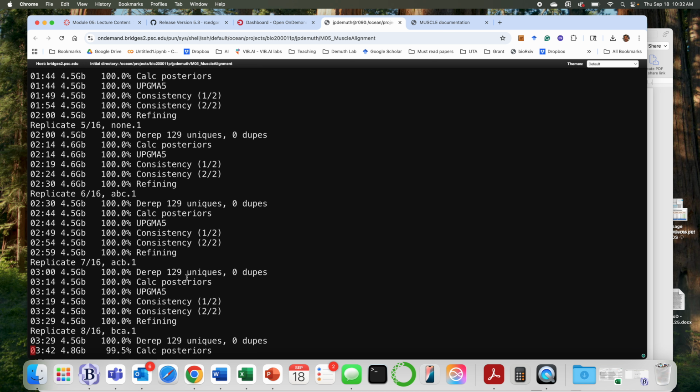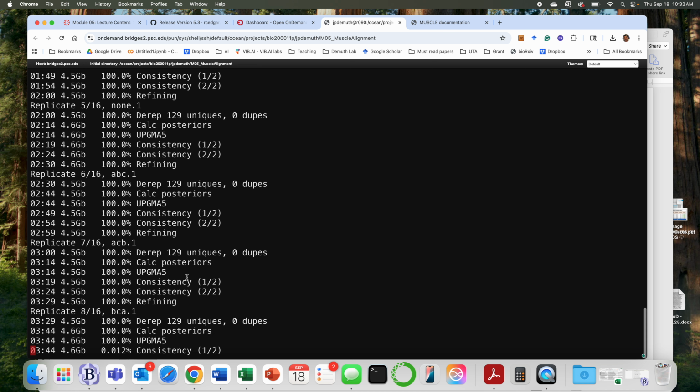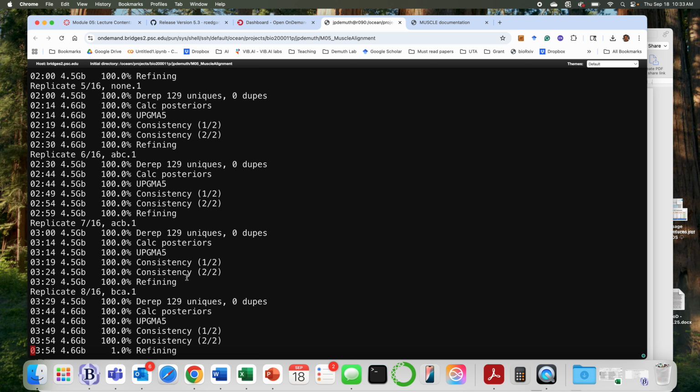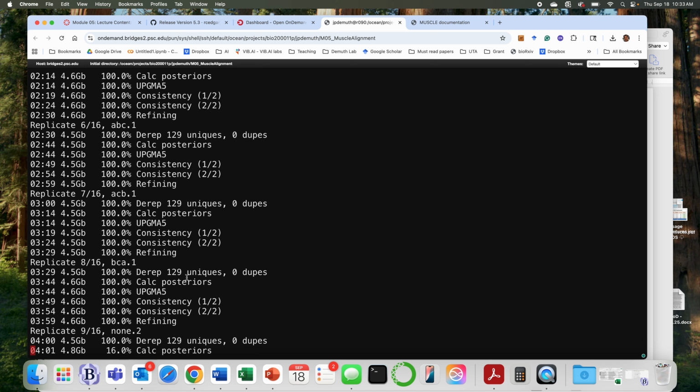So it looks like you did it correctly. Yeah, so now you have a space after P450. You keep moving the space around. First it was before the dot, then it was after the dot. But in your file name, there's no space. Anytime you put a space in the command line, it's reading it as another item.